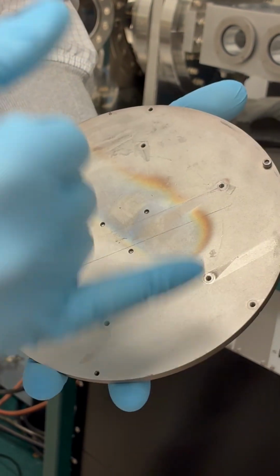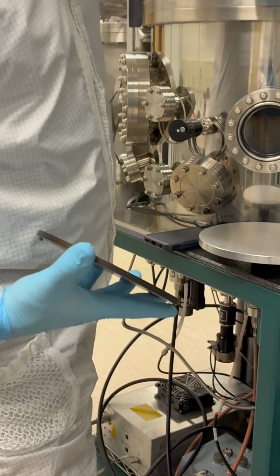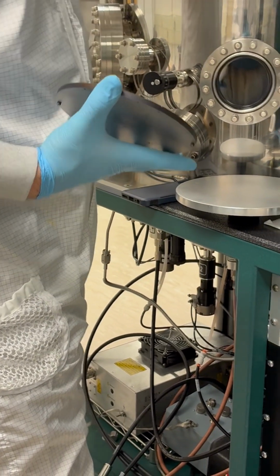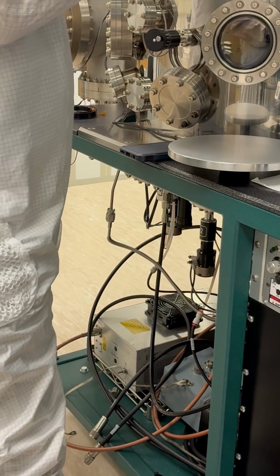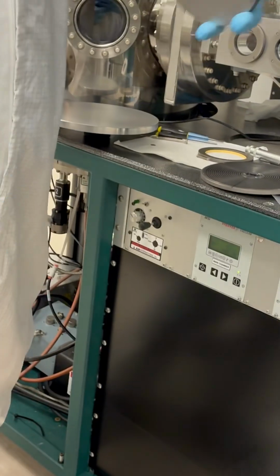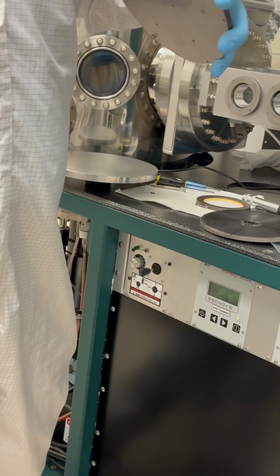There's no real good way to see it here, but there could be variation across the sample, like from this side to this side. Your platinum is growing over here and aiming kind of at your sample, so this side is going to grow faster than the far side. But if you rotate it very slowly, over your 10-minute growth, it might rotate 200 times. And so the variation from one side to the other is going to be much smaller, because it'll grow less here and more there, and as it goes around, it'll get more and less and more and less, and that'll average out. Okay?